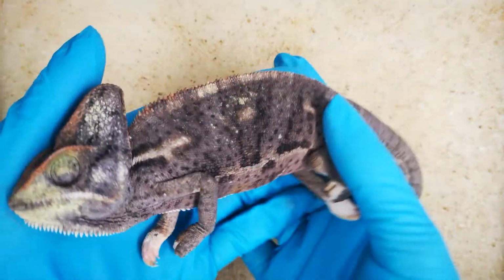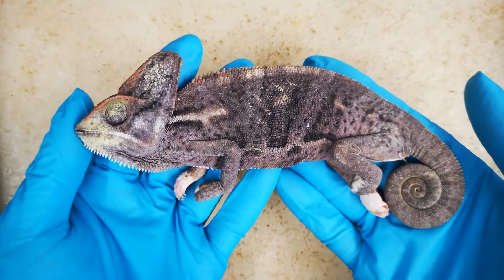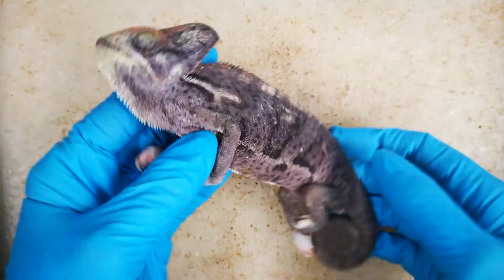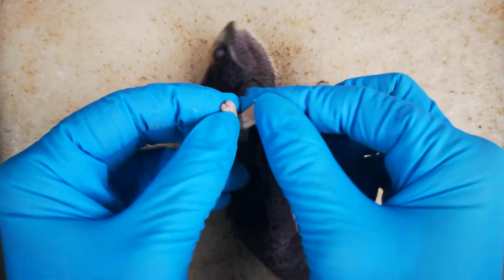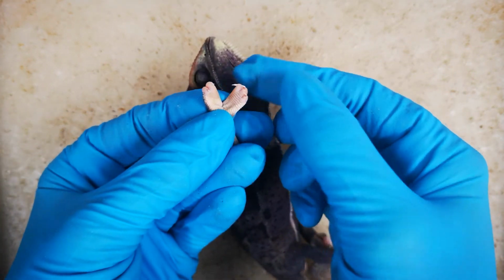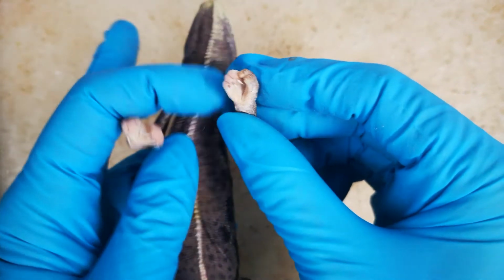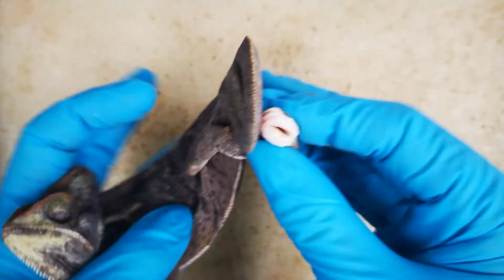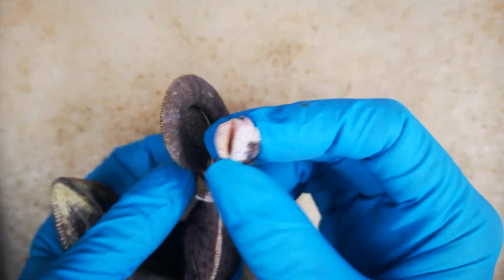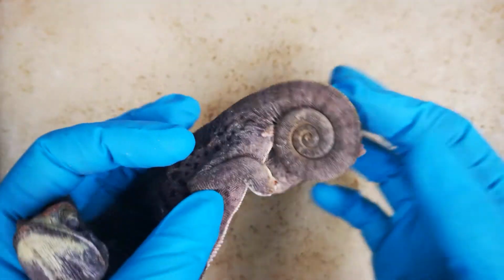Also, their internal anatomy is quite unusual because the body of most species is laterally flattened, so that it is very narrow but also very deep. For this reason, dissection of chameleons is carried out in lateral, not supine position. We can observe that the bundles of the hands and feet are different. The hands have a bundle of 2 outer and 3 inner digits. The feet, on the other hand, have 3 outer and 2 inner digits.